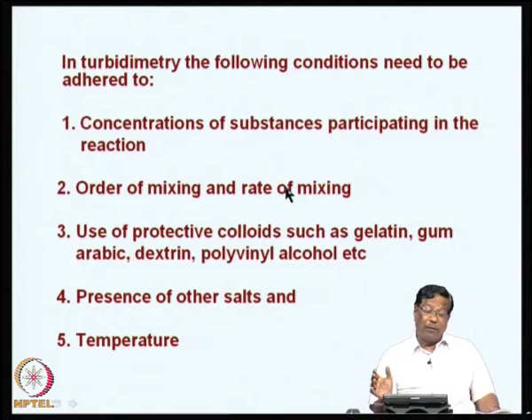Even in a turbidimetric determination, simple operations of mixing like this or like this, or a machine which keeps on shaking like this, all these parameters will affect the turbidity readings.